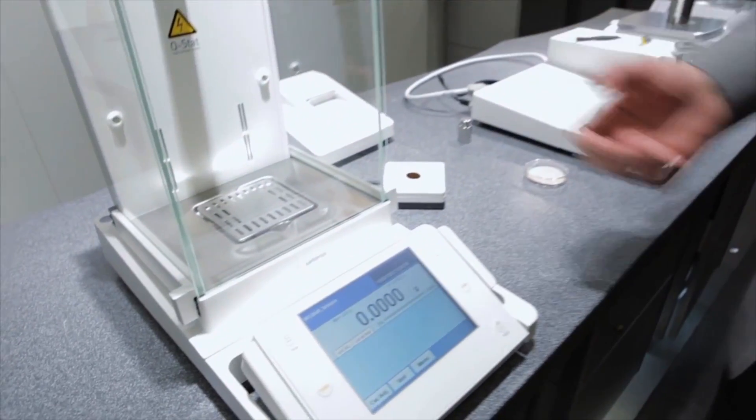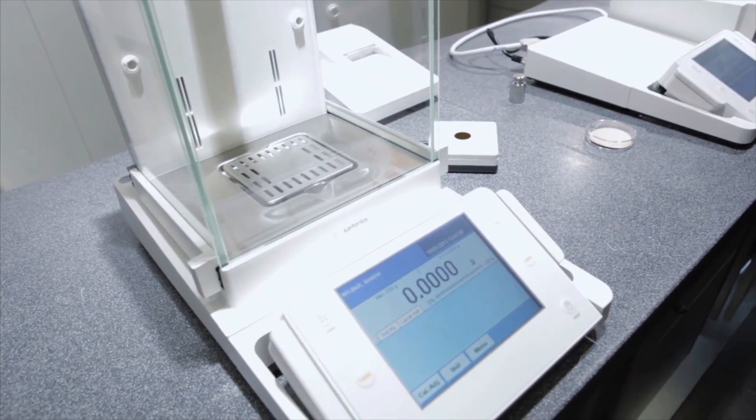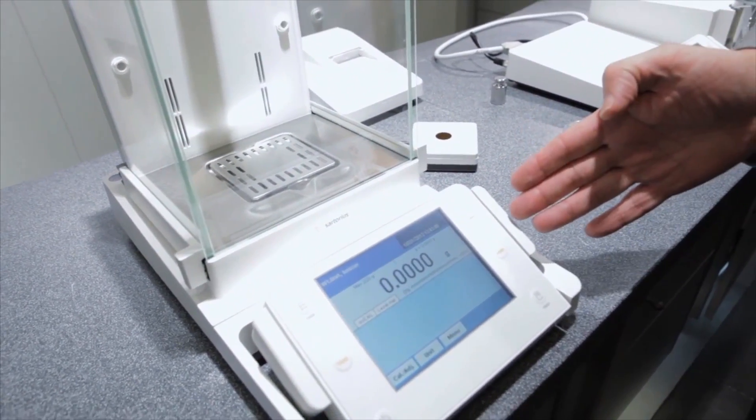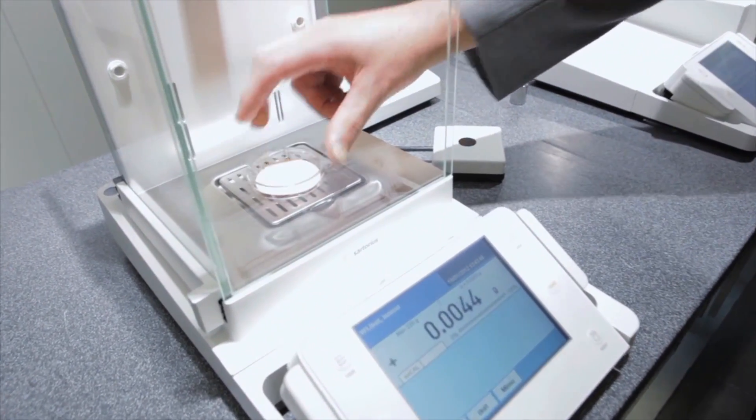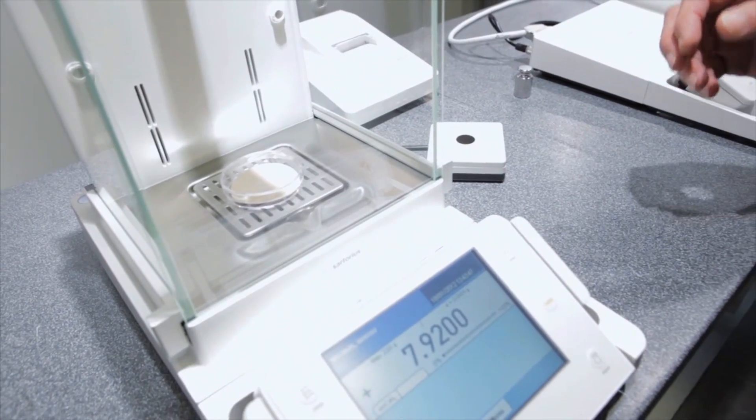If we want to be working with something that's a little bit toxic and maybe we don't want to touch the keys and we have gloves, then we have the possibility with a sensor to work on the balance, open and close the doors without touching.